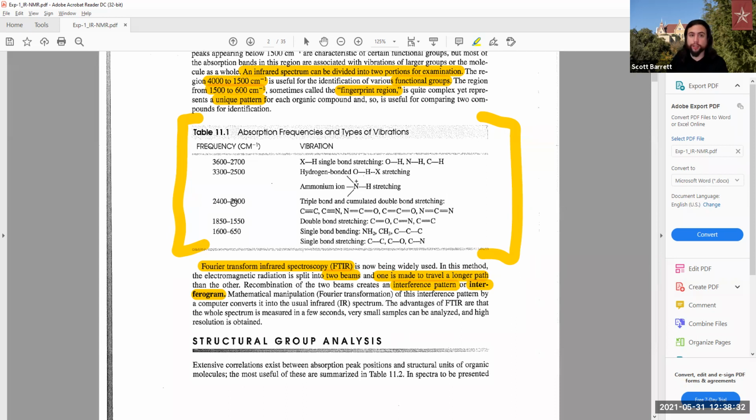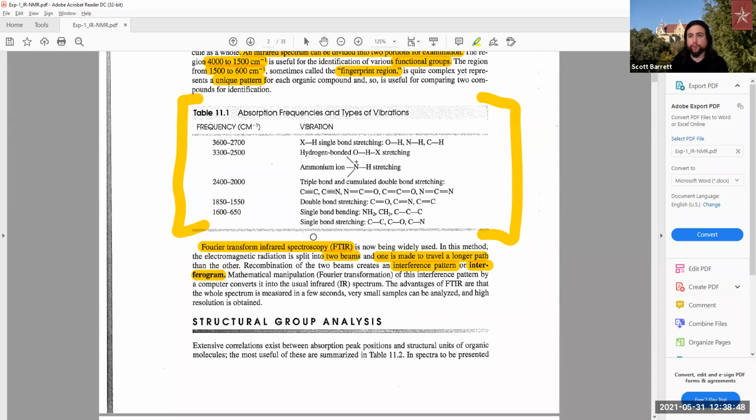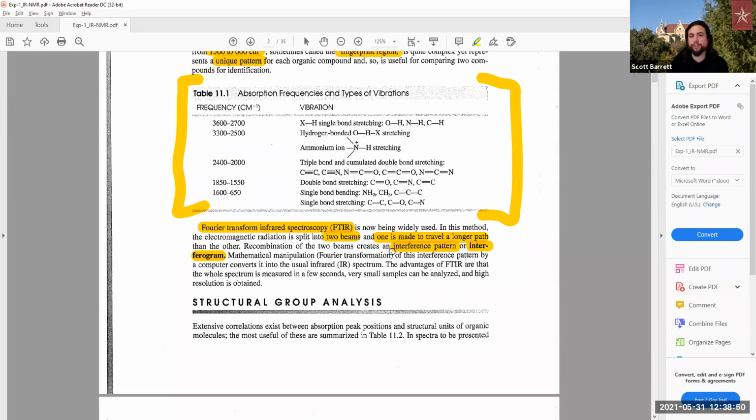Then you would know you need to look within this region specifically. And if you don't see anything there, then you have a problem. That's why an IR spectra is important to analyze, because these things will show for any compound that has specific groups on it. So it's very important for analyzing functional groups whenever you are performing an IR spectra.